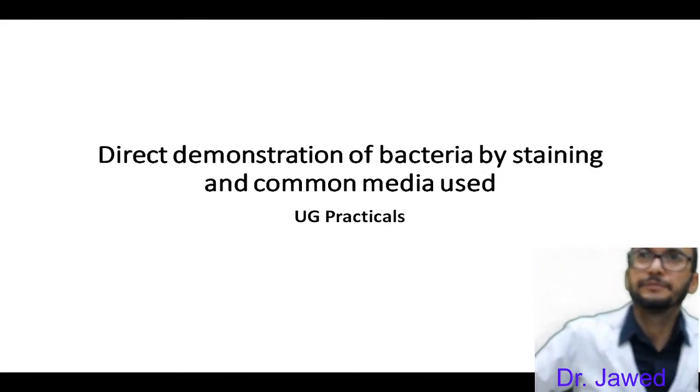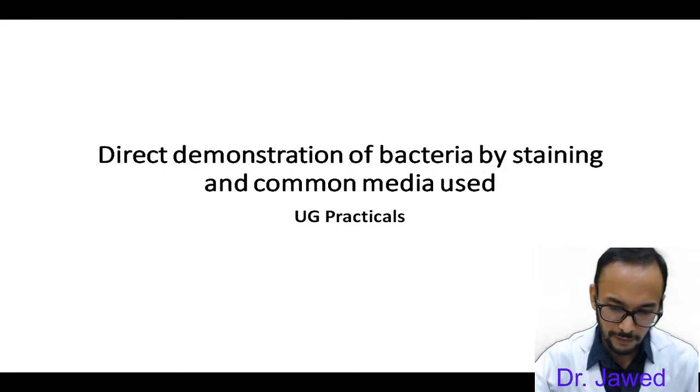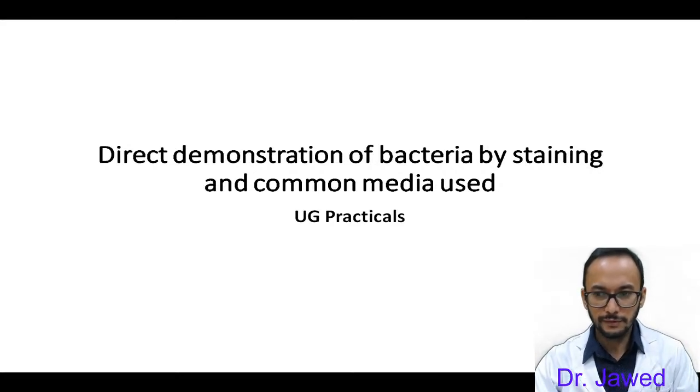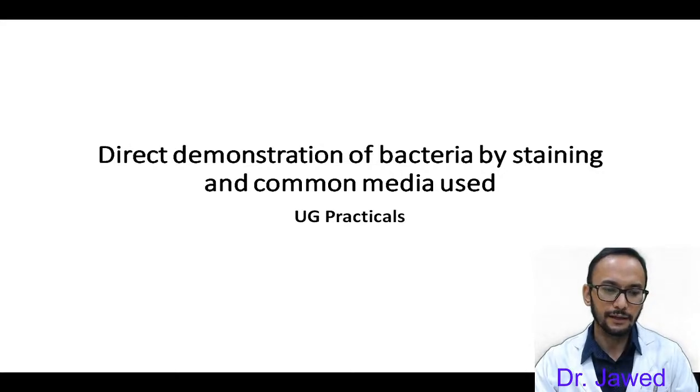Hello, sir. Hello everyone. So today's practical is on direct demonstration of bacteria by staining and the common media that is used in a laboratory.